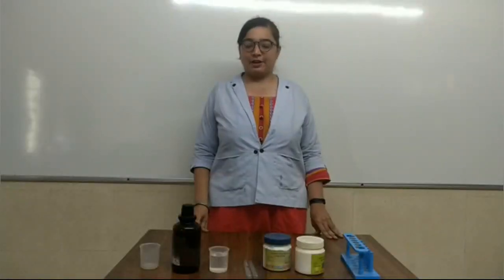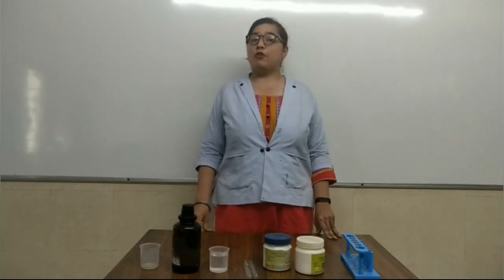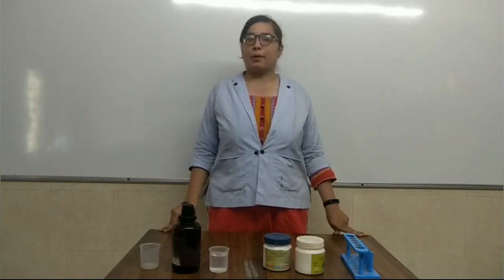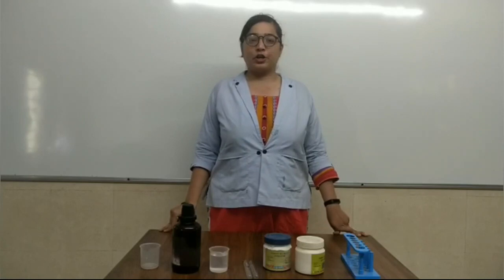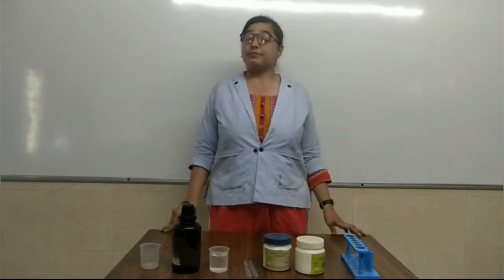Hello my dear friends. Let us now see the nitrate test. First of all, whatever things you are eating, in them also there is some proportion of nitrate. And today we are going to do a ring test for the formation of the nitrate.